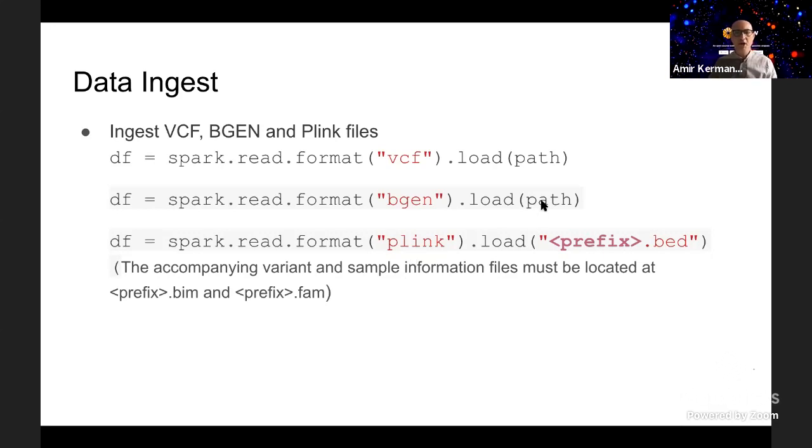So keep in mind that we have codecs. You don't have to specify anything in terms of the encoding. It can be gzip, bgzip, or just flat VCFs.